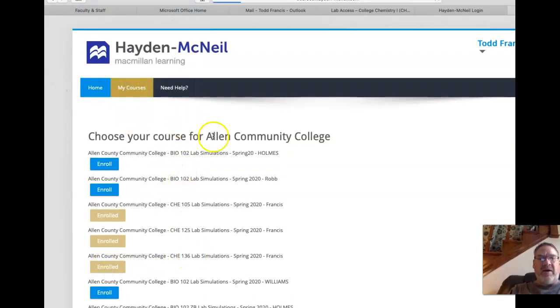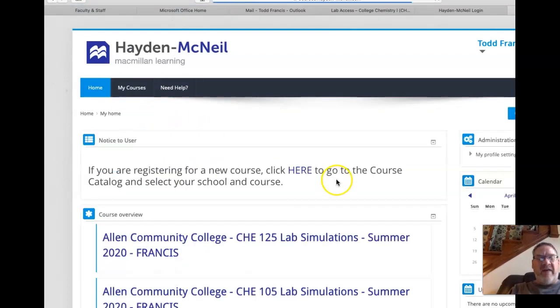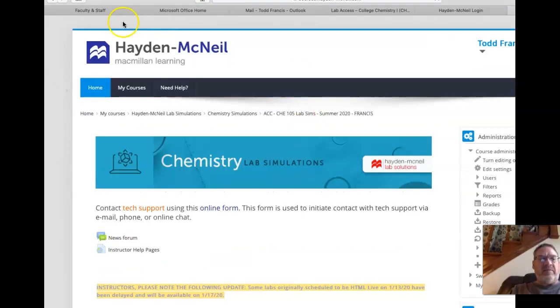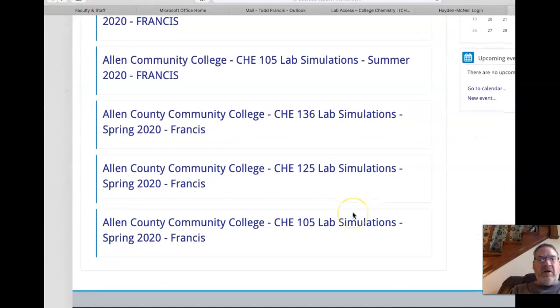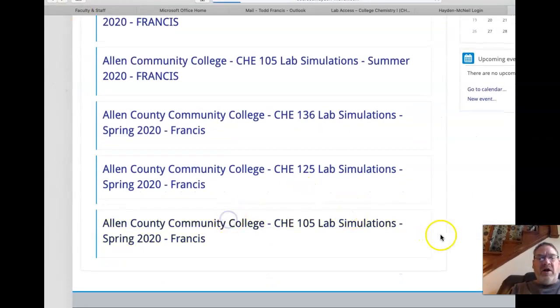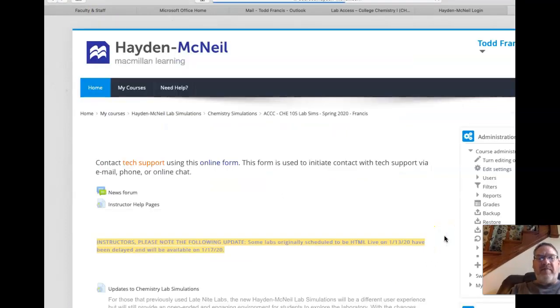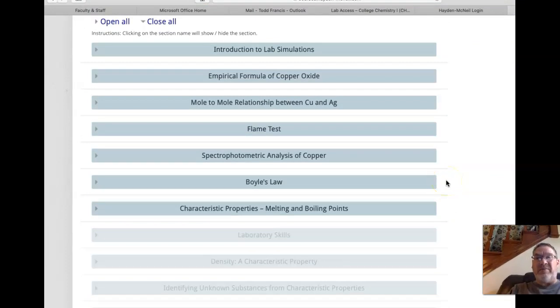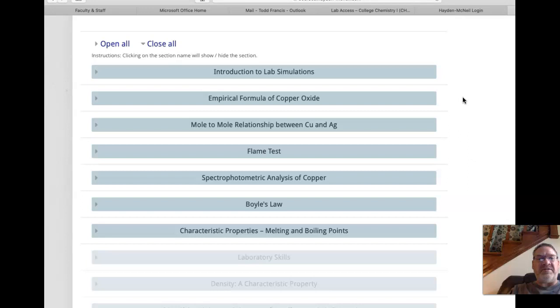Okay, once you're enrolled in the course, I'm going to go to my courses here. Like I said, I already have this set up. What you're going to see for this, so I'm going to go to the 105 page. I already have the series of labs that you're going to complete with this. One of these I'm going to take out just because of time considerations.